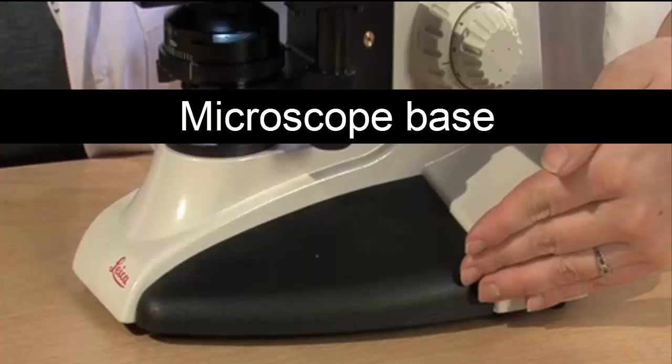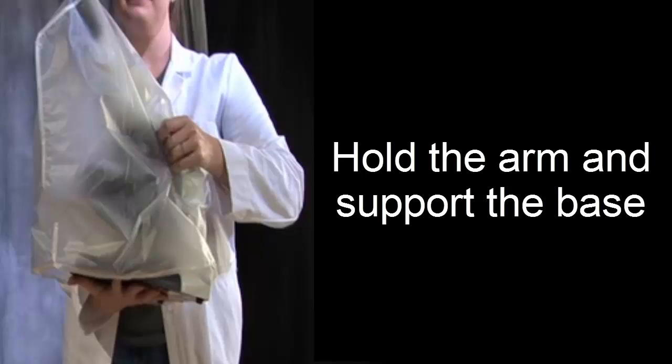The very bottom of the microscope is called the base. When carrying the microscope, you should always hold the arm and place your other hand underneath the microscope for support.